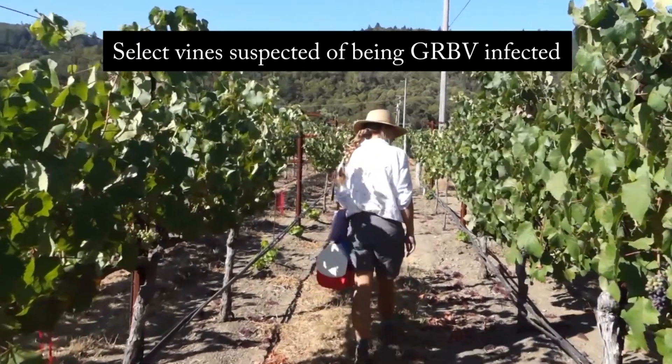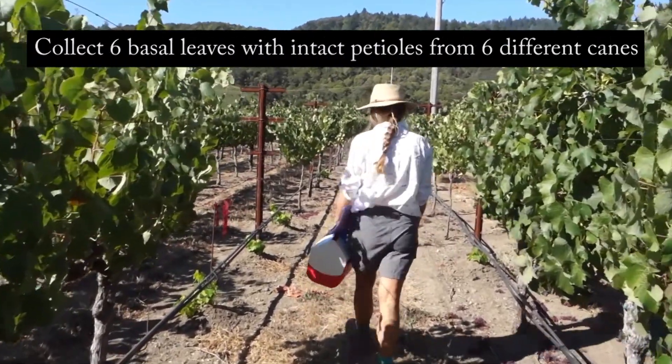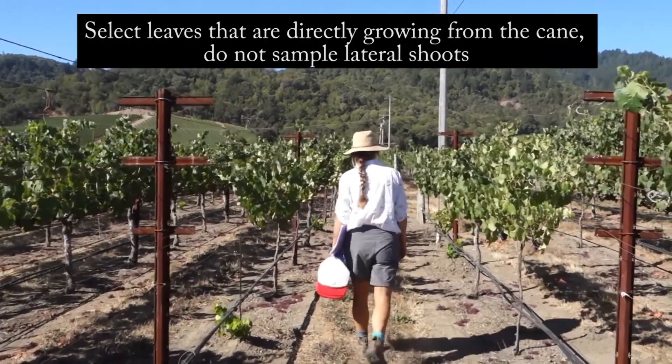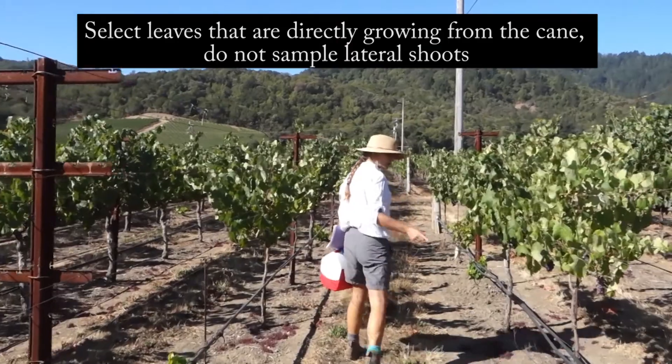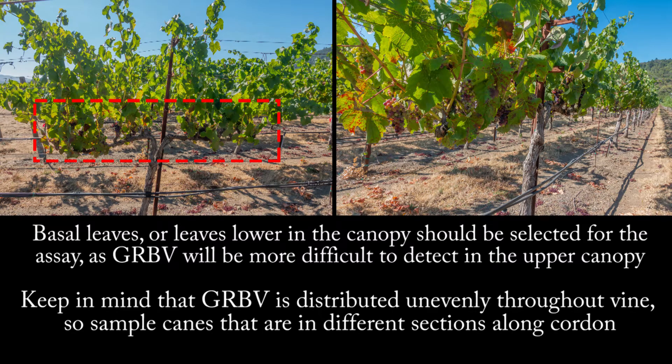Select vines suspected of being infected with red blotch. Collect six basal leaves with intact petioles from six different canes. Select leaves that are directly growing from the cane — do not sample lateral branches. Basal leaves or leaves lower in the canopy should be selected for the assay, as the red blotch virus will be more difficult to detect in the upper canopy. Keep in mind that red blotch is distributed unevenly throughout the vine, so sample canes that are in different sections along the cordon.